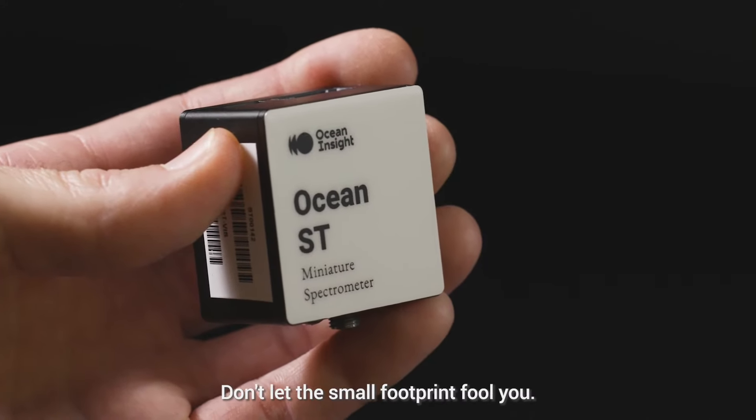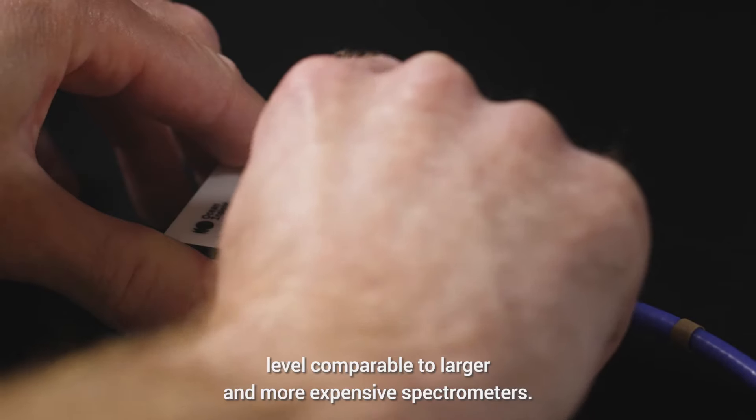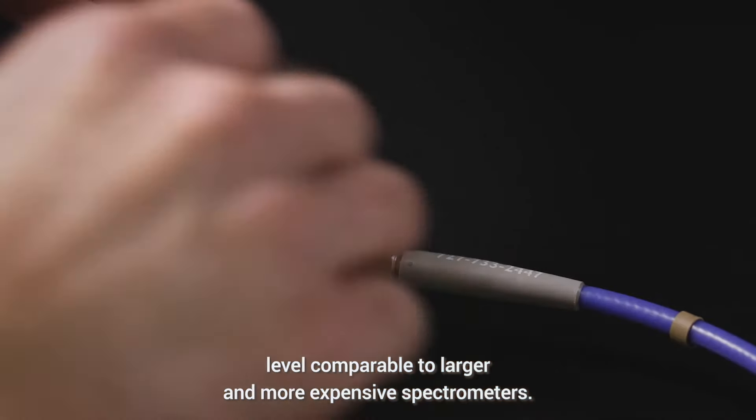Don't let the small footprint fool you. The OceanST delivers full spectral analysis at a performance level comparable to larger and more expensive spectrometers.